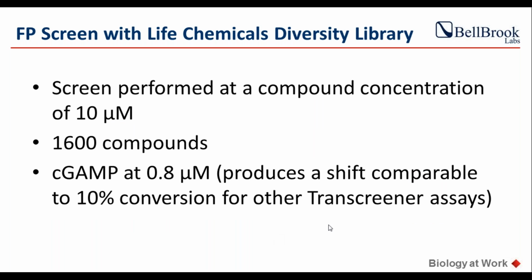With all that determined, we determined the ideal concentration of cGAS to use. We confirmed that 100 micromolar ATP and GTP and 60 nanomolar DNA was a good standard condition to identify ATP competitive inhibitors, GTP competitive inhibitors, or even inhibitors that probably compete with DNA.